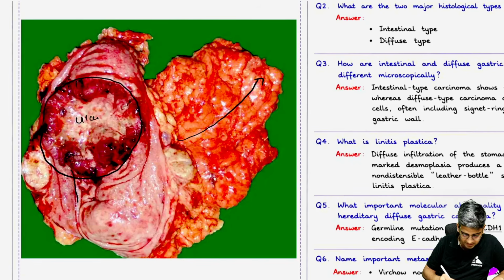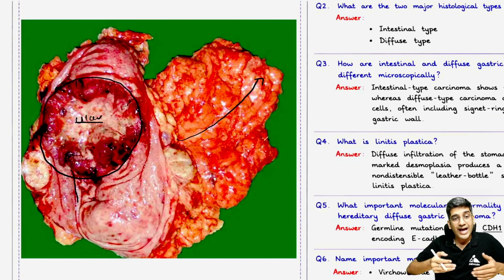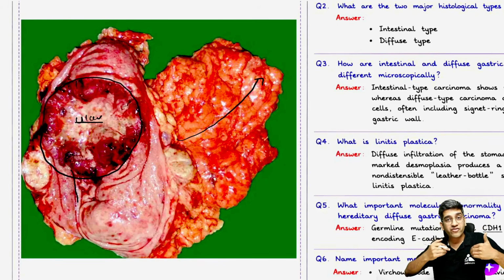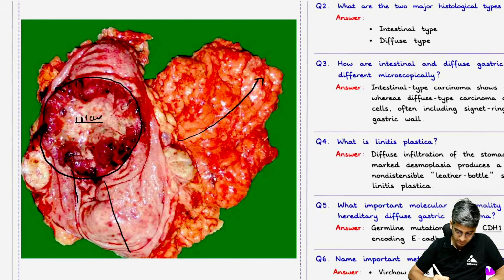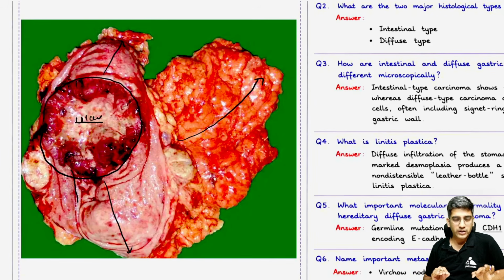This part is the ulcer. The whitish area is the ulcer, which has the necrotic tissue there. And there's a mass which is proliferating surrounding that. I have a 4 into 5 or 6 into 7 centimeter fresh specimen. If you have a scale, measure and tell, which is so many centimeters from the proximal, so many centimeters from the distal margin. Very important to tell.